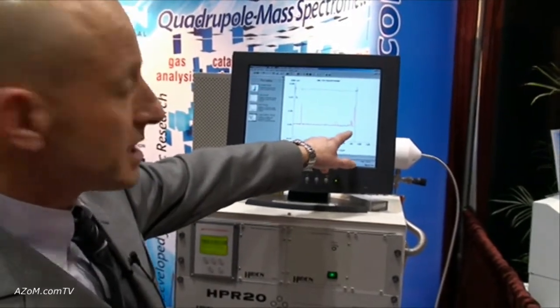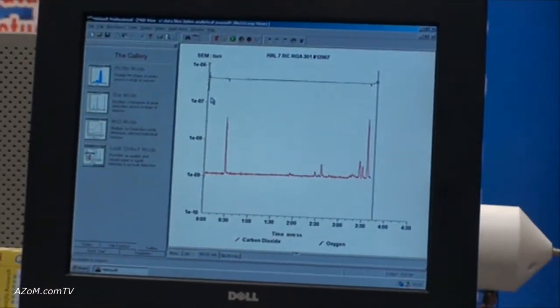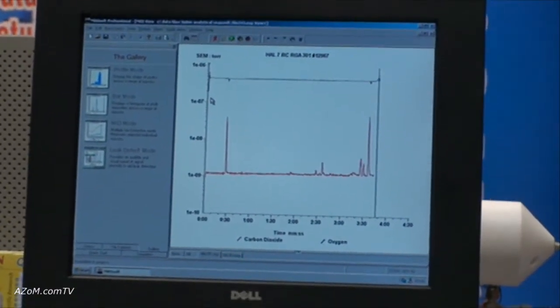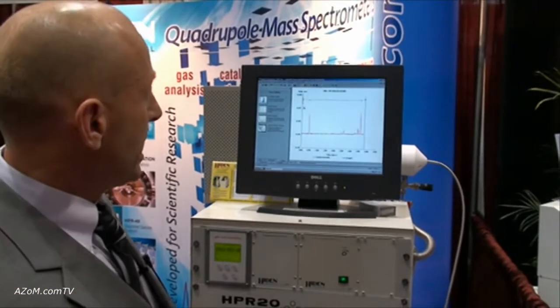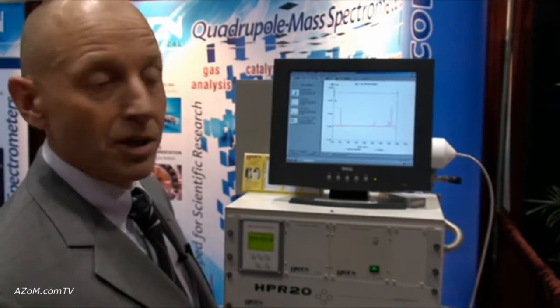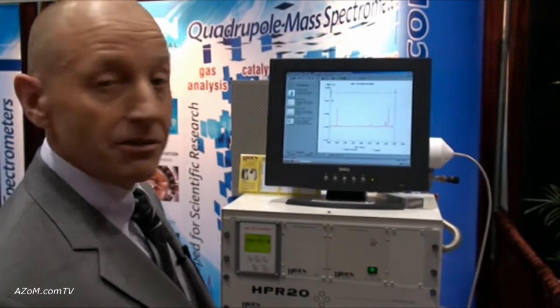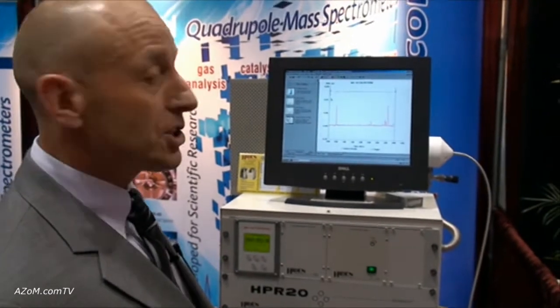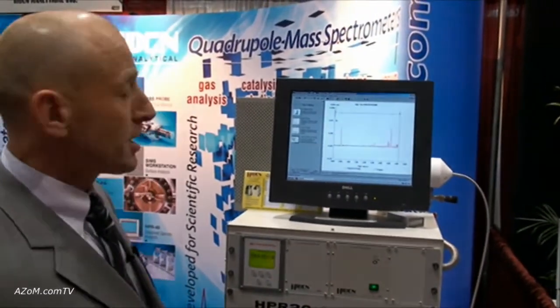We can see there the rise in CO2 and the depletion in the oxygen level as I breathe into the capillary — a really nice fast response system. It's very flexible; you could connect this up to a multitude of different peripheral devices: thermo-gravimetric balances, GCs, reaction calorimeters, and a whole range of process systems including fermenters and environmental monitoring systems.